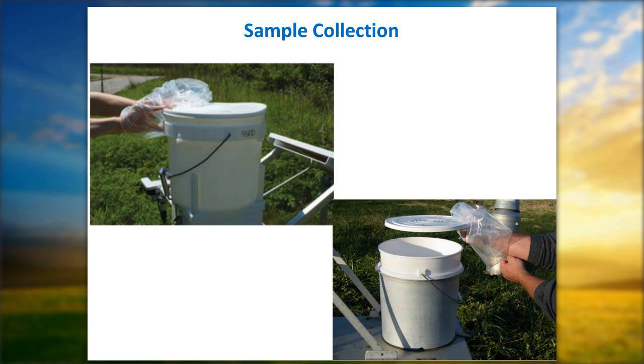One important aspect in sample collection is to always make sure that, whether you're working with either one of these particular collectors, you visually inspect the sample before putting that lid on. What is currently there when you first open that lid, after transportation, swishing, whatever may occur from moving your sample from point A to point B, can get diluted and not necessarily be there. So we like for folks to make remarks as to what you initially see when the collector opens up.